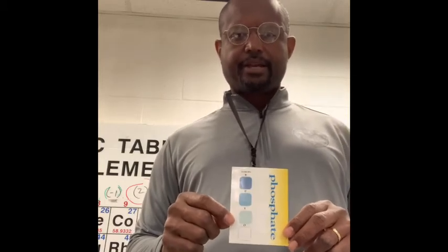The next test I'll conduct from our water quality study of Birky Pond is phosphates. Phosphates, like nitrates, come from the fertilizer runoff in our area. Other sources of phosphate would include things like detergents; the use of phosphates in detergent was banned years ago to protect our streams. But like nitrates, phosphate also leads to algae bloom and eutrophication.